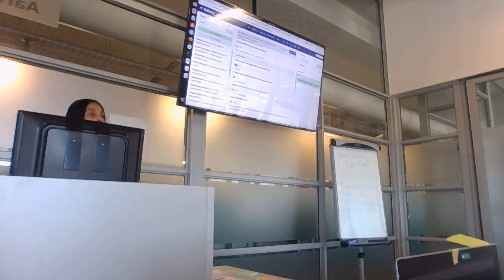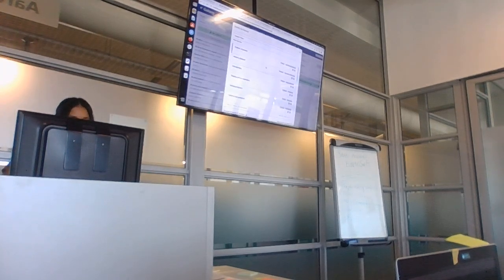And then I'm going to go to my, how do I go to my history? To a different history. Switch to history, and I can select.